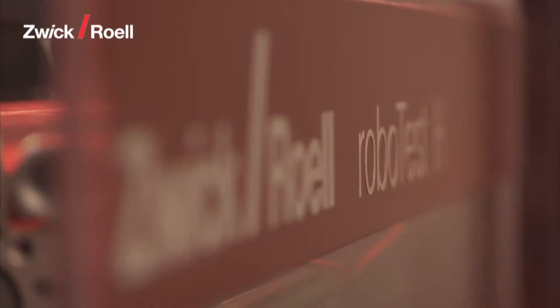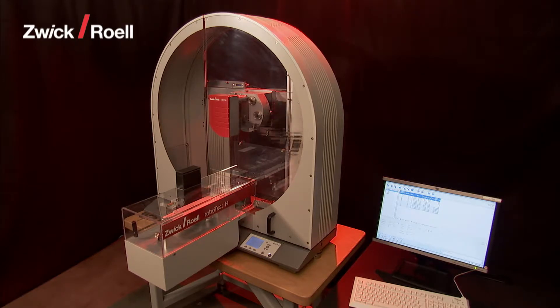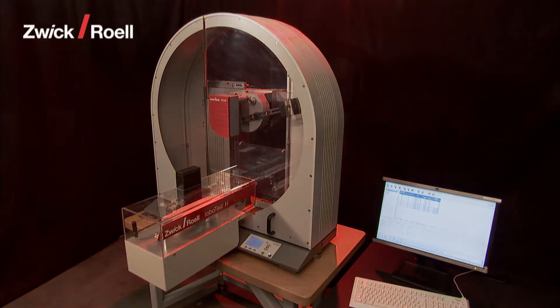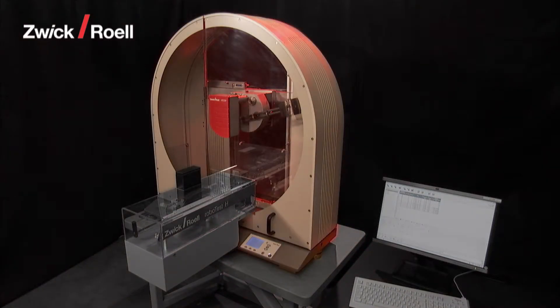The RoboTestH Robotic Testing System is designed for fully automatic Charpy or IZOD impact bending tests on plastic specimens. It consists of the following elements: The RoboTestH Robotic Testing System with specimen magazine and the Zwick 25 Joule or 50 Joule Pendulum Impact Tester.